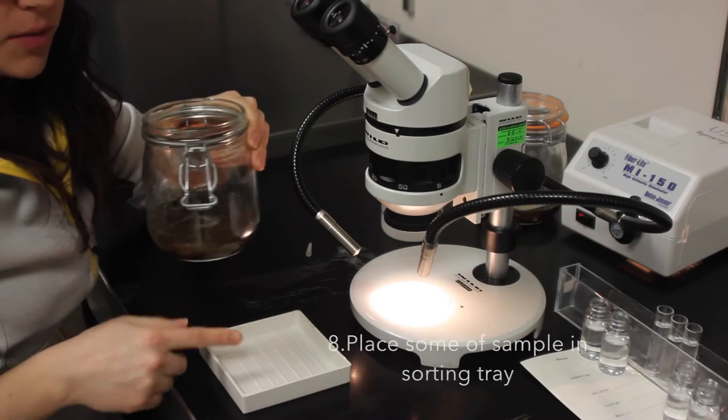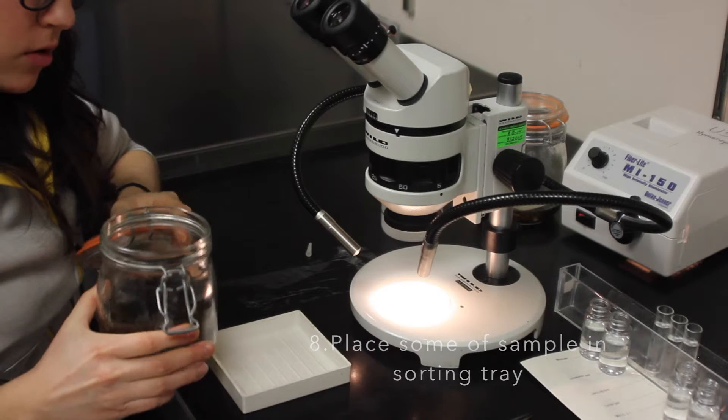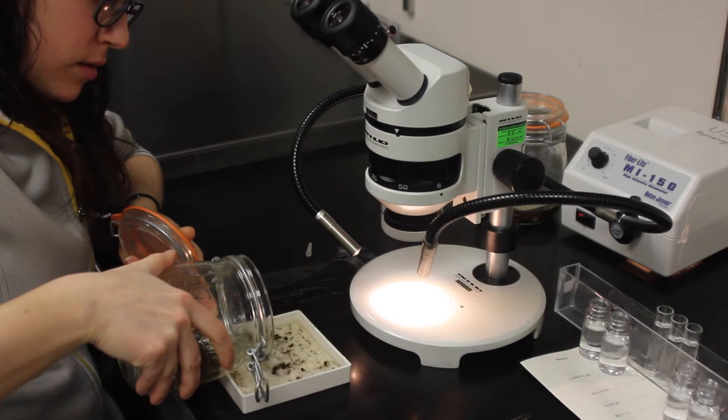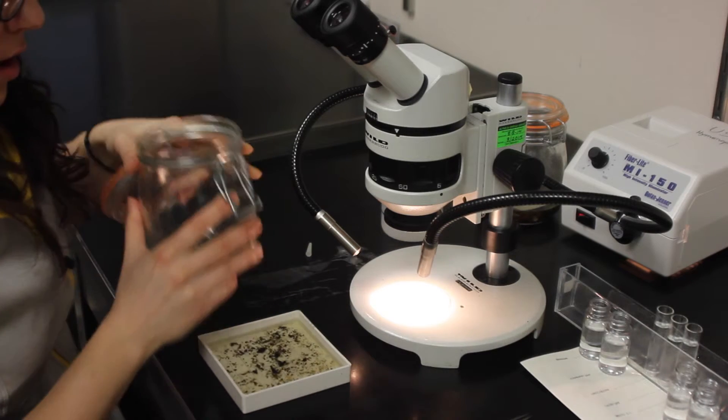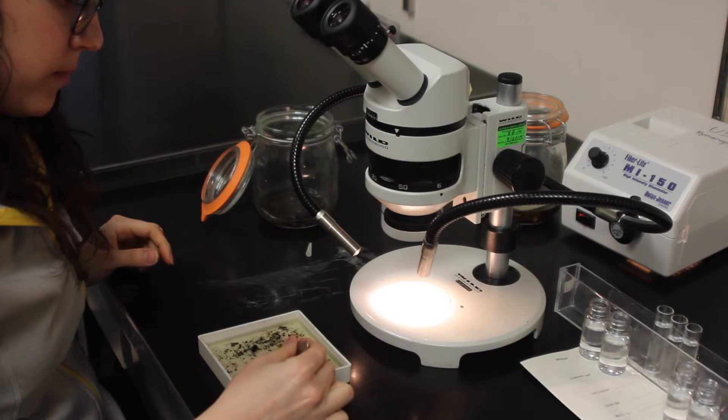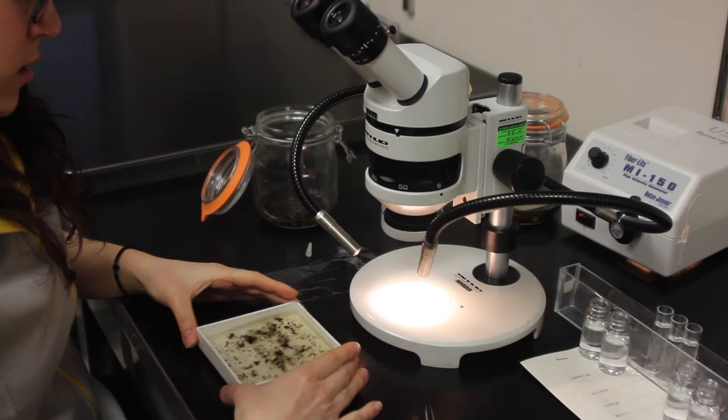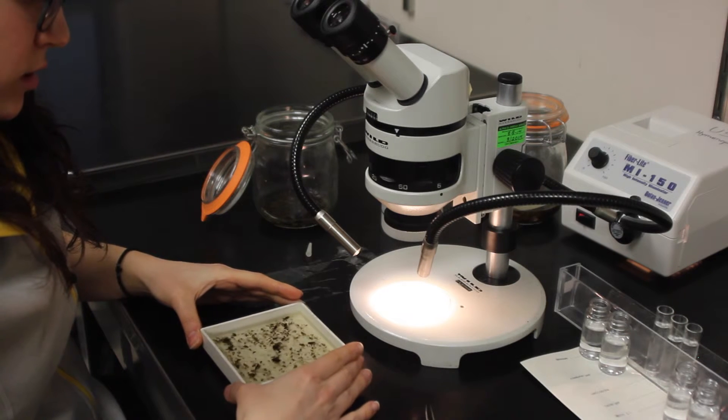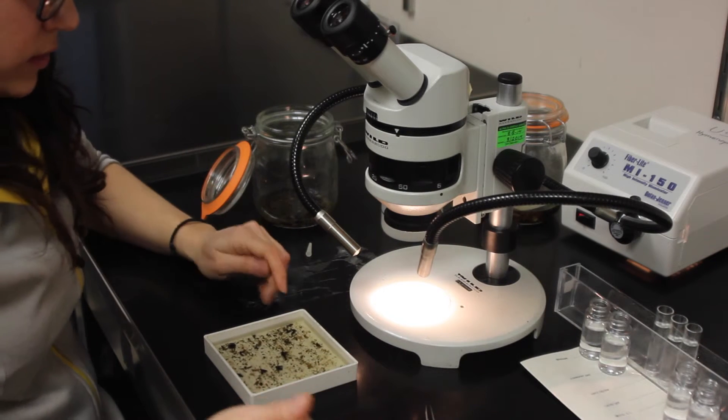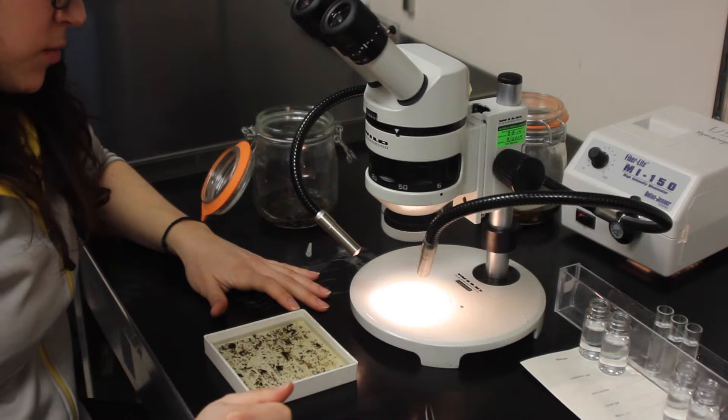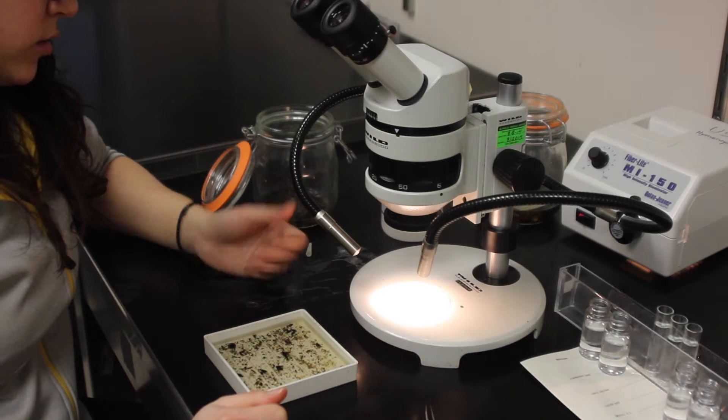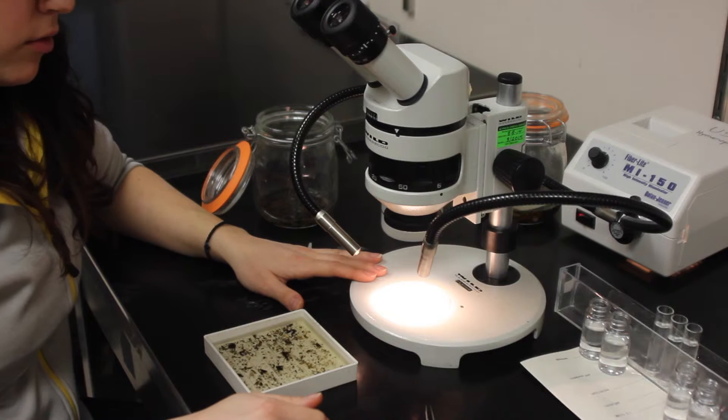We're going to pour our sample into the small sorting tray. Give it a swirl and pour it in. This sample is dense, so we're only going to put half of our specimen in so that we can see what's going on. We're going to give this a shake to make sure that our specimen are spread out evenly. And if you can see, the small sorting tray has rows, which allows you to visualize your organisms left through right when you're looking through your microscope.